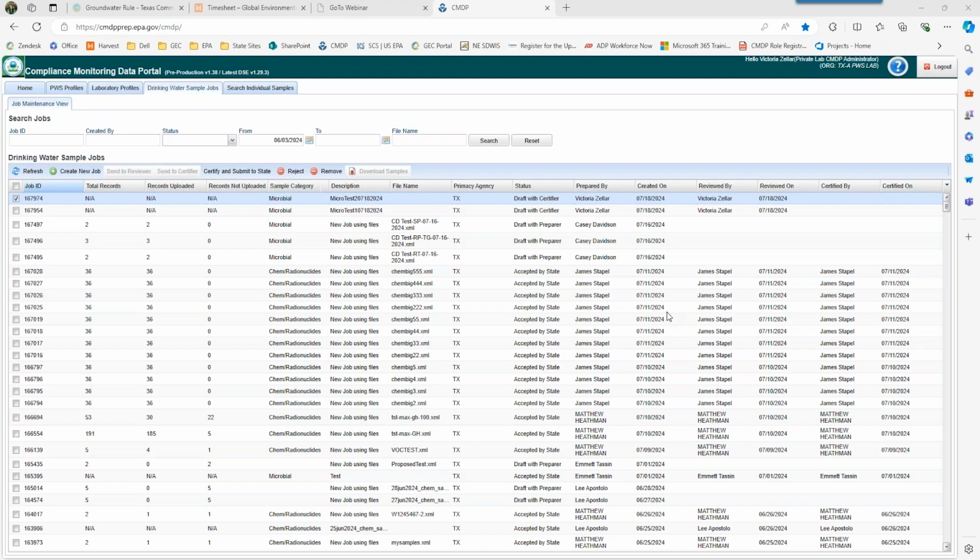Yeah, question for Texas. Until STEERS is decommissioned, does that mean microbial samples will need to be sent via CMDP and STEERS? No. Once your lab has transitioned and gotten approval to submit samples through CMDP production, you would not need to do samples through both ways. As far as getting the approval, if you will, we call that a path to production.